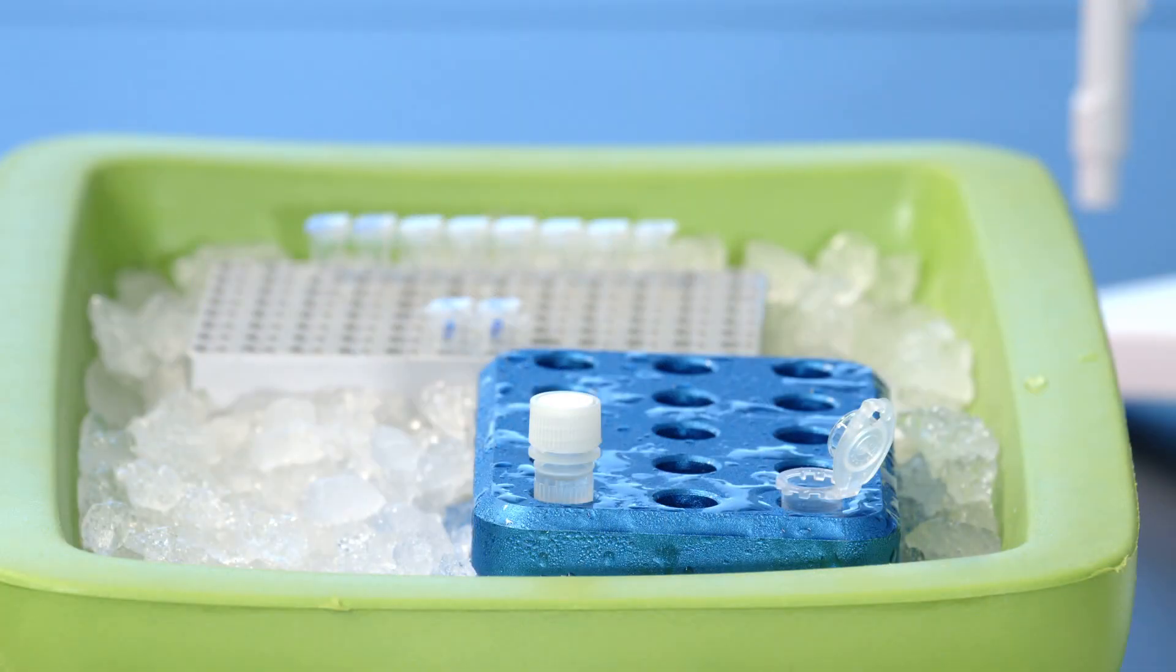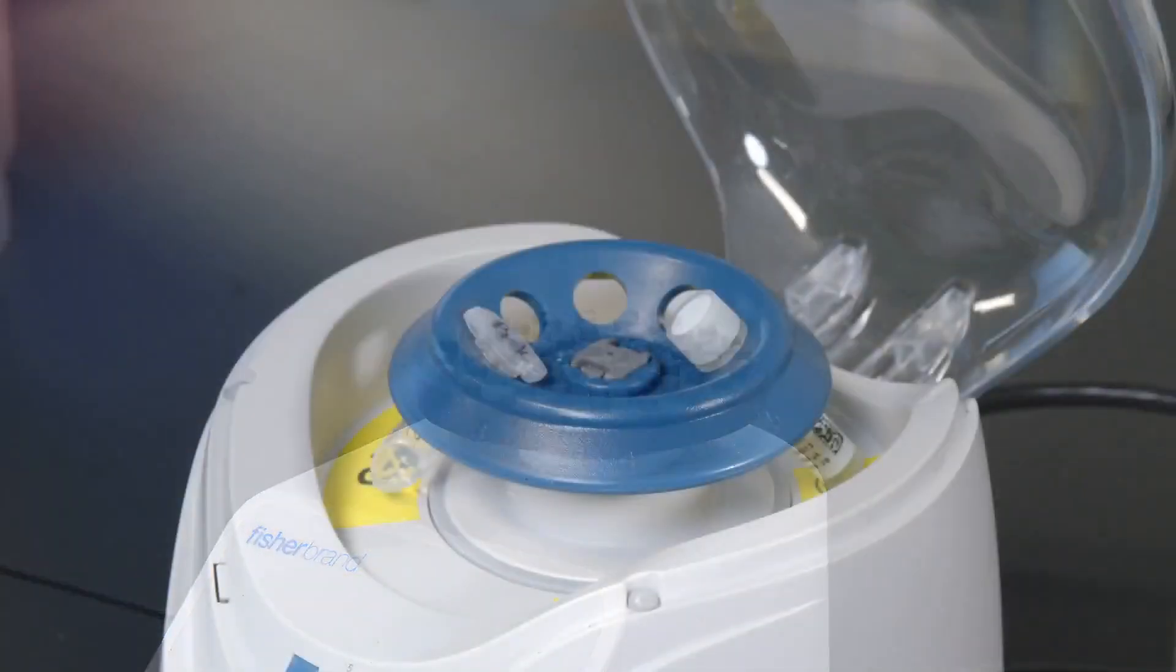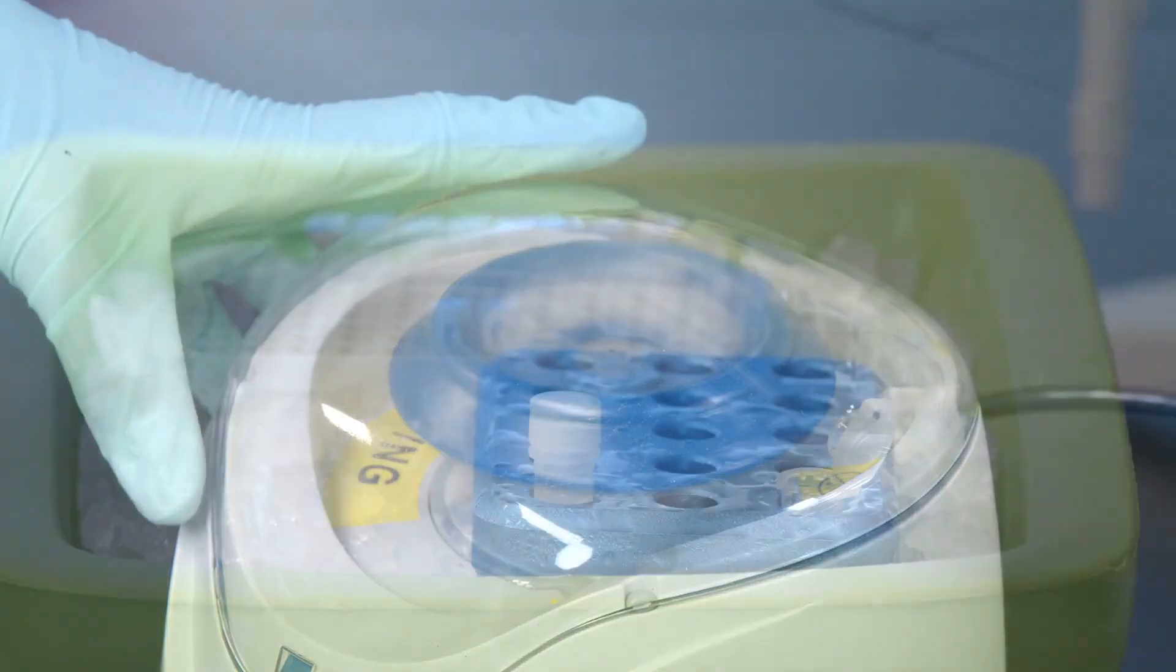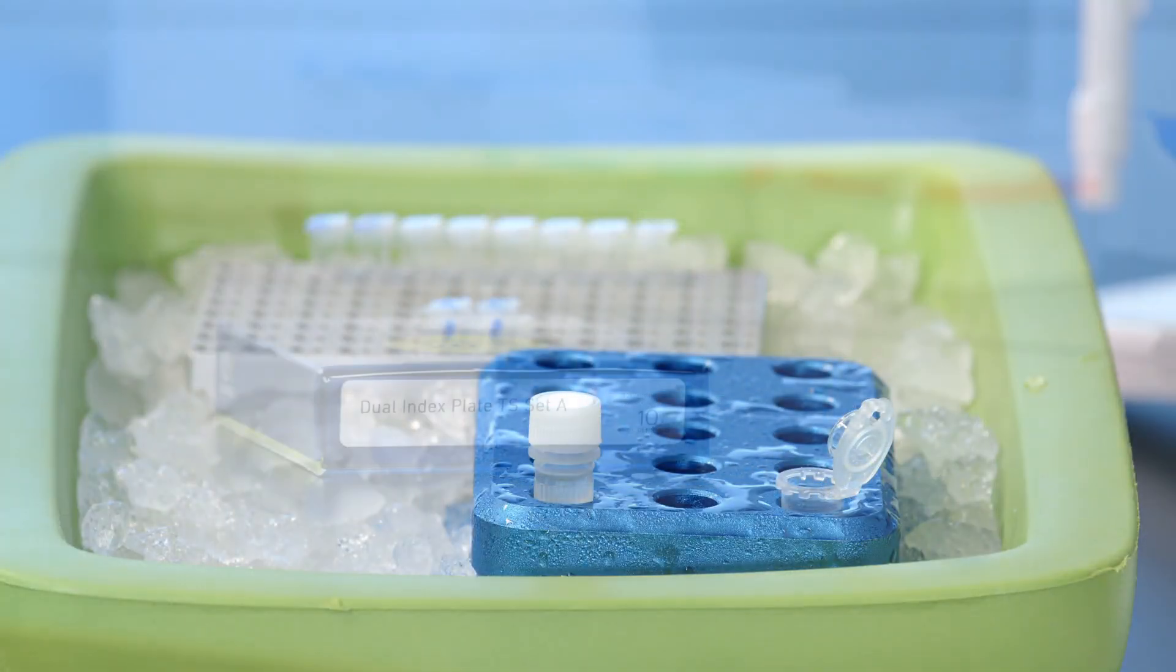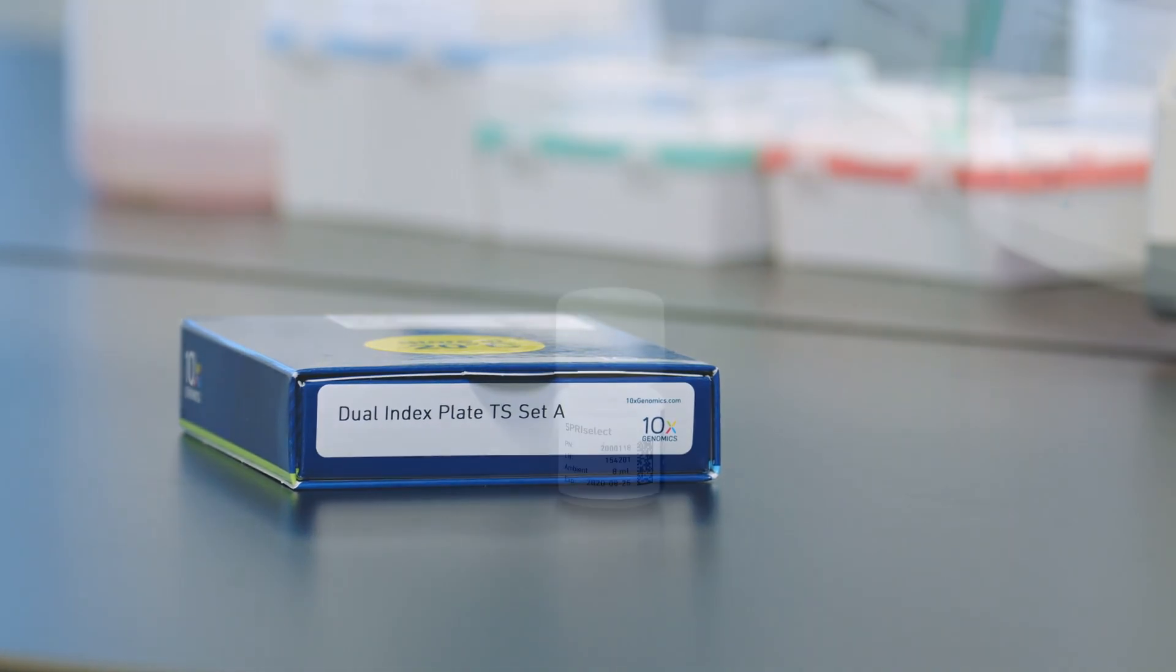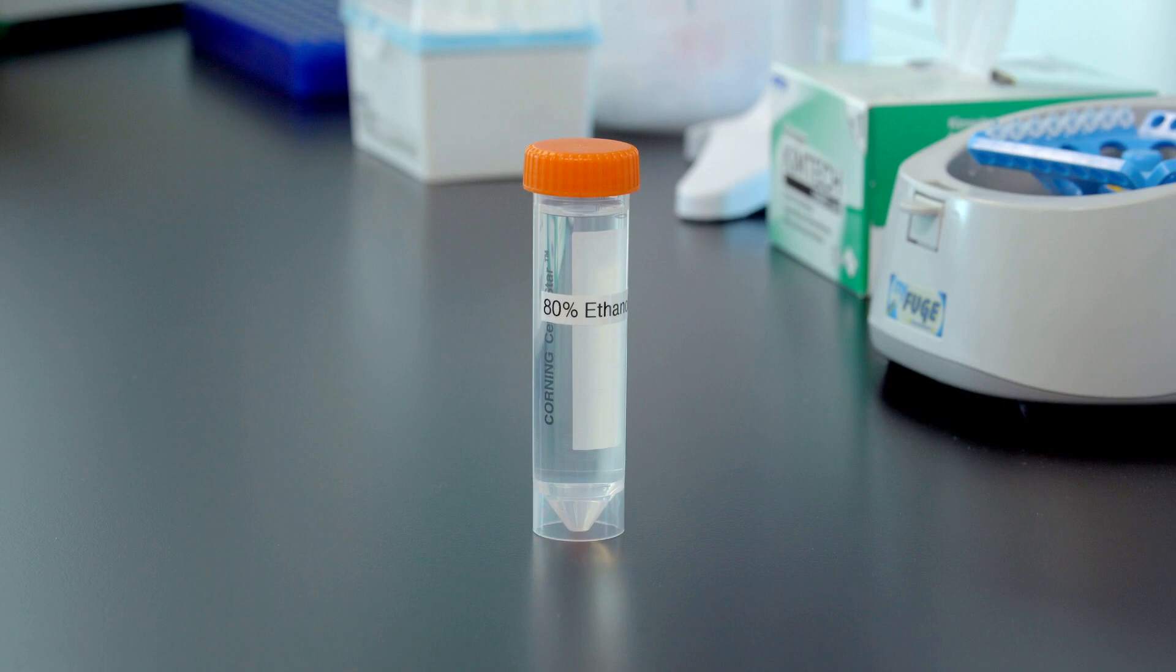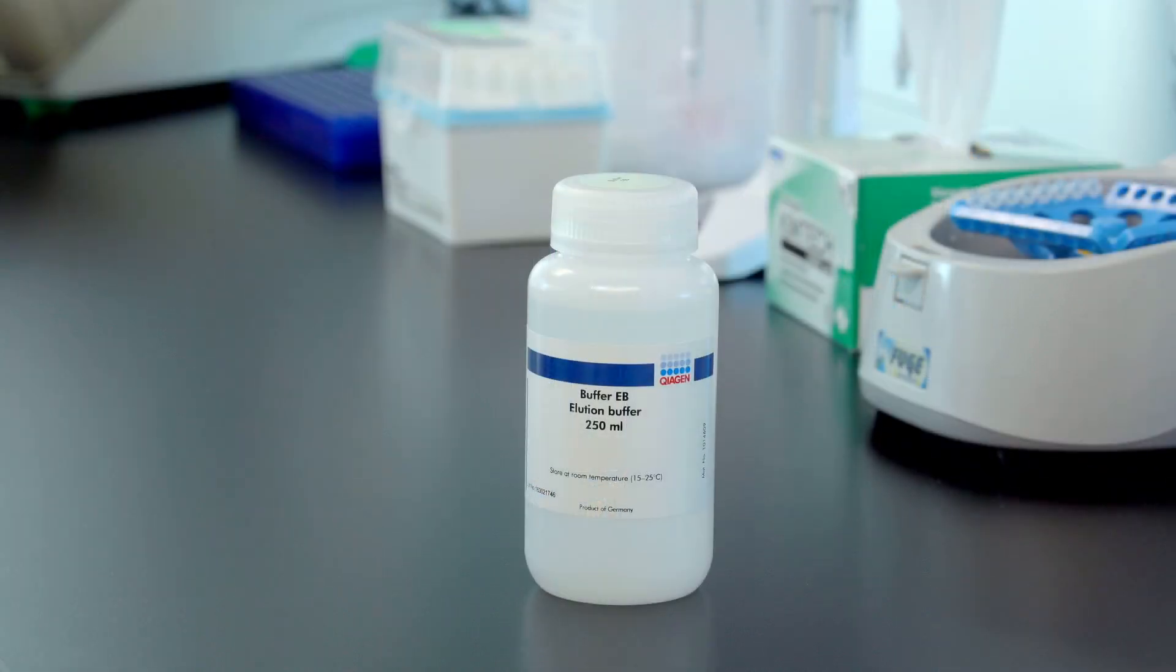We have determined the amplification cycle number and will now perform sample index PCR and SPRI select cleanup. We have Amp Mix B—vortex, centrifuge briefly, and place on ice. We have the dual index plate TS set A, SPRI select reagent, freshly prepared 80% ethanol, and buffer EB.